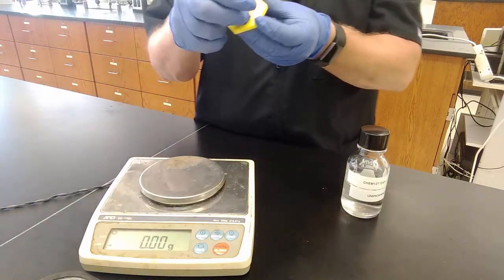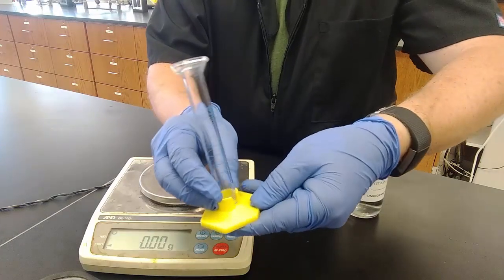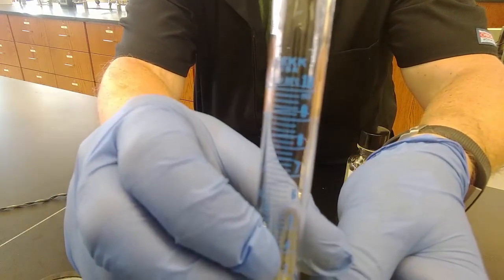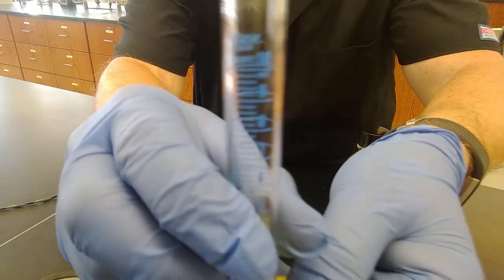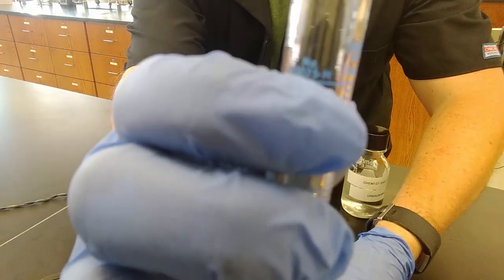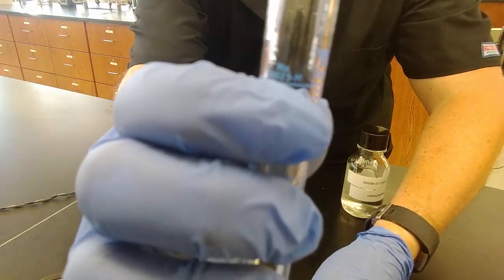Now, interestingly, this 10 milliliter graduated cylinder says on it, it'll focus, come on, focus for me. I don't know if it will. Let's see if I can put my finger on it. That might help. This one says TD at 20 degrees.